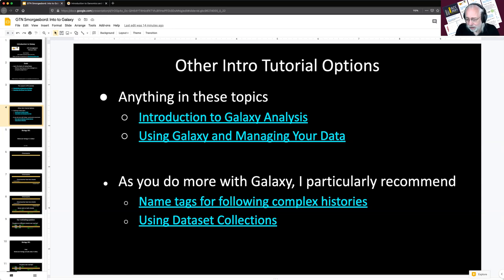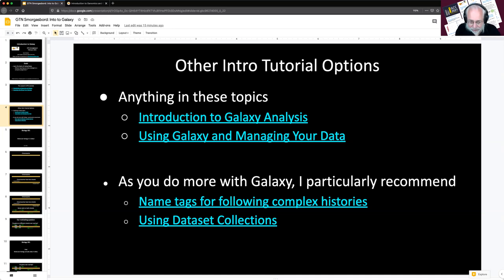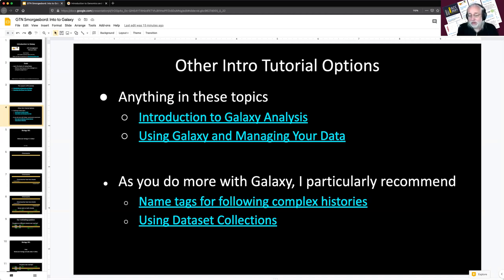As you do more with Galaxy, I particularly recommend name tags for following complex histories — a great tutorial which will teach you very useful things once you get multi-input, multi-output analyses. Also, using dataset collections: if you use Galaxy for large-scale experiments with 20 conditions over 20 time points, you will want dataset collections. Without them, things become quickly intractable.